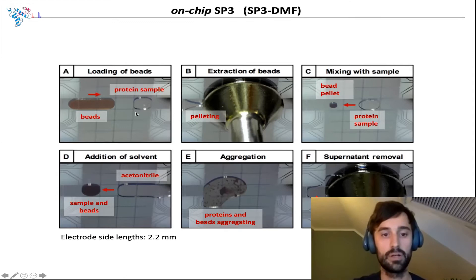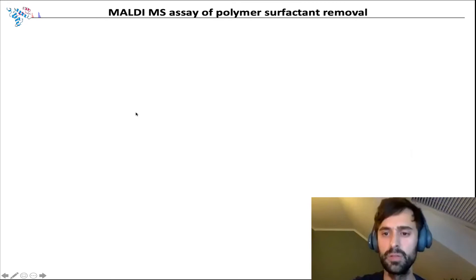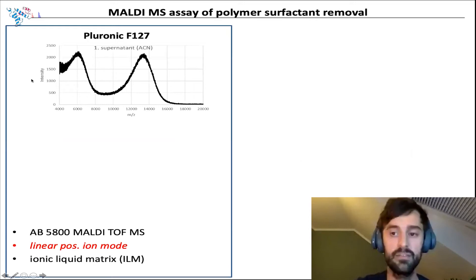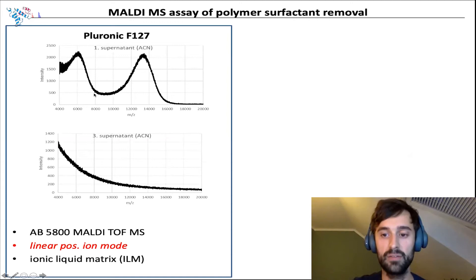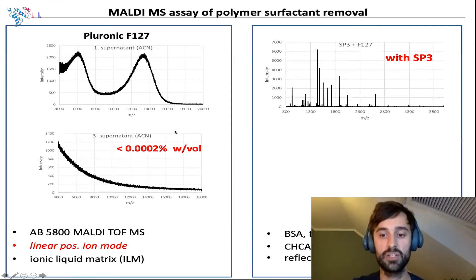Can we be certain that SP3 removes these surfactants? Yes, we can. We can measure them in the organic supernatant of the SP3 by MALDI-MS. What you see here is a characteristic mass distribution of Pluronic F127, which can be derived from the first SP3 step. When we measure the supernatant of the last SP3 rinsing step, we don't detect any polymer anymore, and we have quite low LODs for this polymer surfactant. If we now compare a digest of BSA that remained on the beads, we get a nice clean peptide mass spectrum, whereas without SP3 we saw quite strong ion suppression by this surfactant.